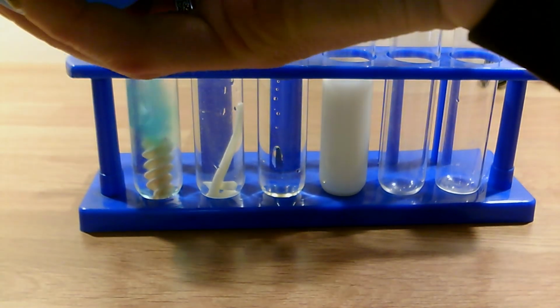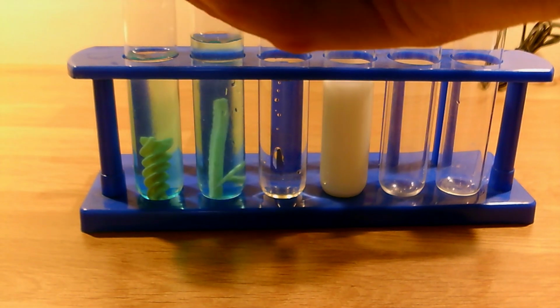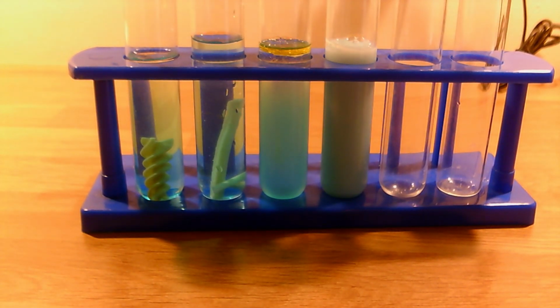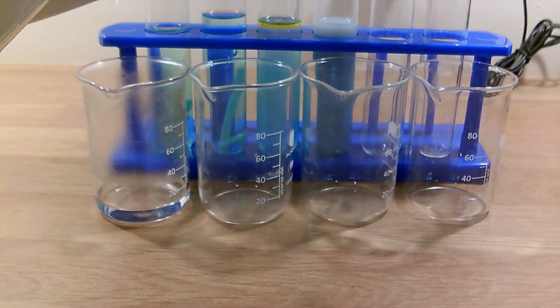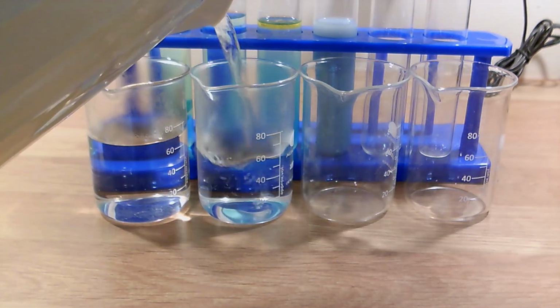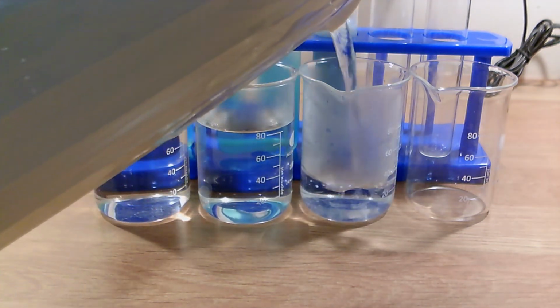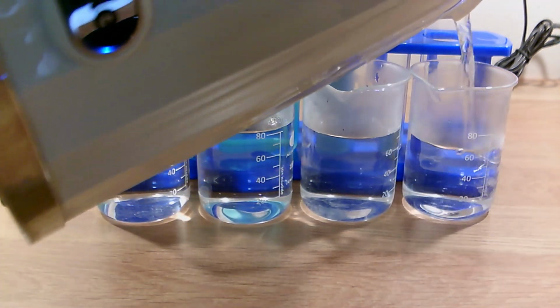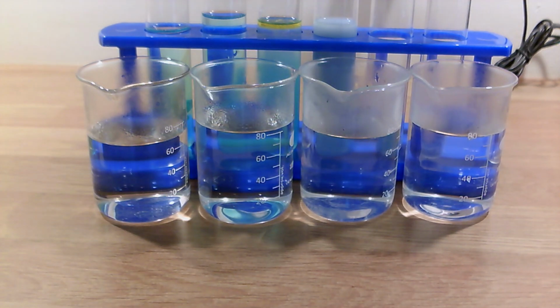We are now putting the 4 foods that we had used for the other 3 food tests with water into the test tubes, and then we are adding Benedict to the test tubes too. We are now going to add some hot water that we've just boiled into a beaker that we're going to put the test tubes into. This is our water bath. We are pouring some water from a kettle into the beaker, and then we are placing each of the test tubes into the beaker.